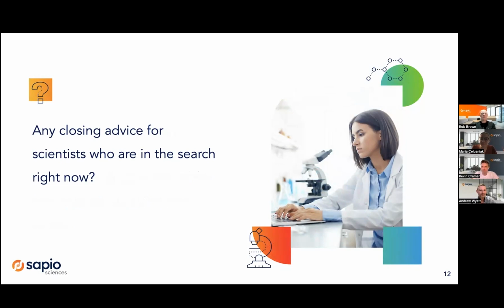I think the biggest advice is just don't settle. Choose a platform that's going to meet all of your requirements straight out of the gate, and choose a platform that's going to delight the users, because they're going to spend their lives in it, right? So for example, if you're looking for an NGS solution, this is especially for you. That platform's an investment in the future of your lab and your results. So just make sure it's really up to the job.